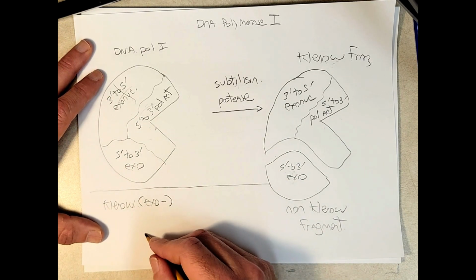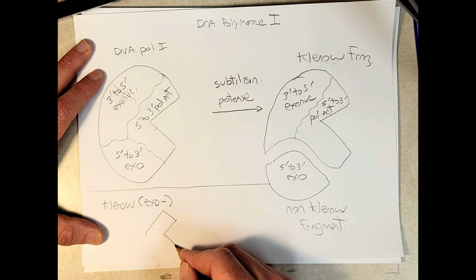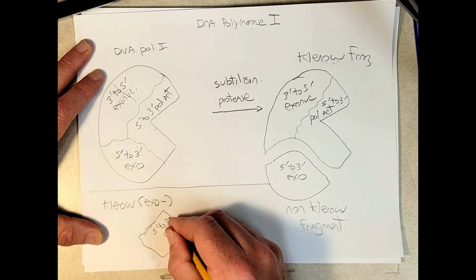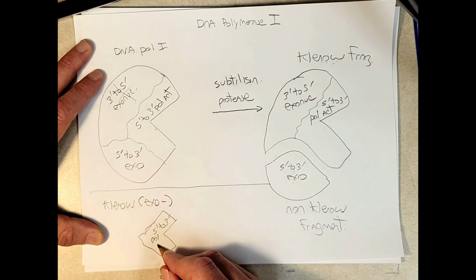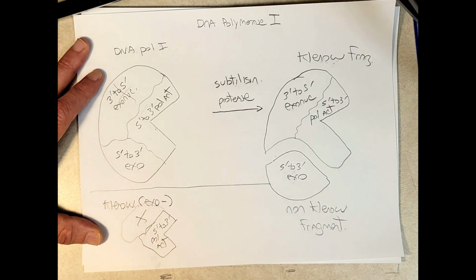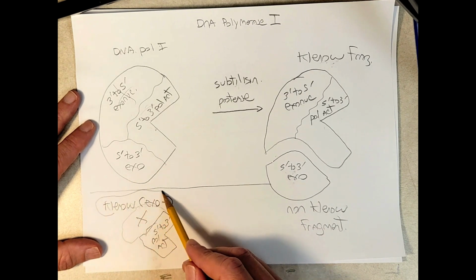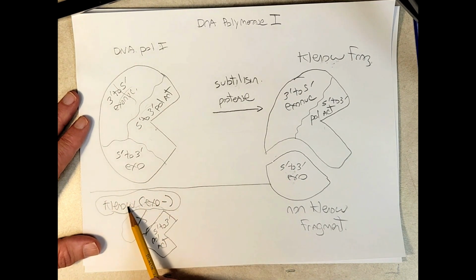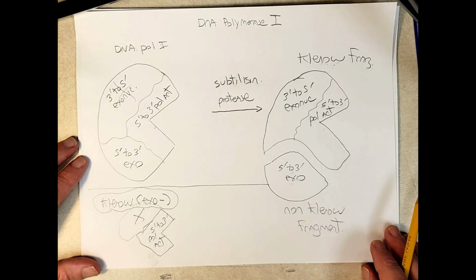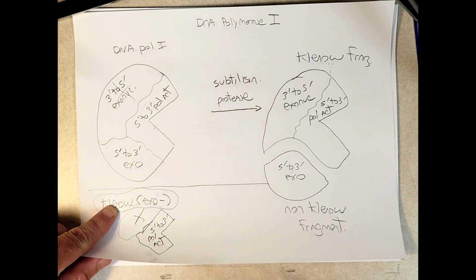well, then essentially we could say it looks something like this. So just the 5' to 3' polymerase activity. In reality, this other part is there, it just doesn't work. Okay, so there's going to be a part later on where a researcher would need to use Klenow exo- for making the sequencing library. So we're going to need both of these at different times.